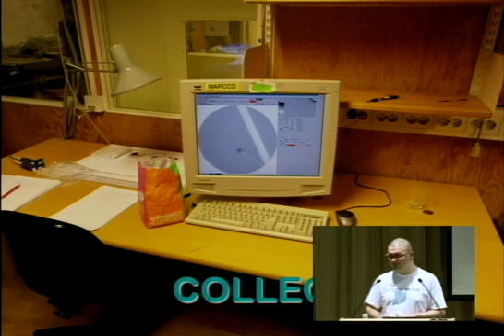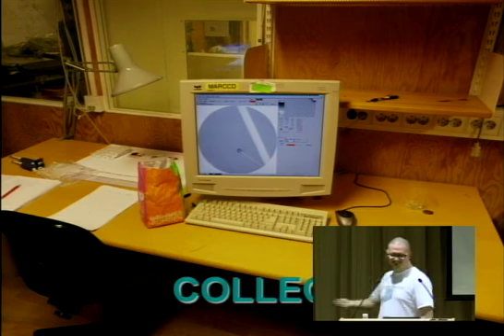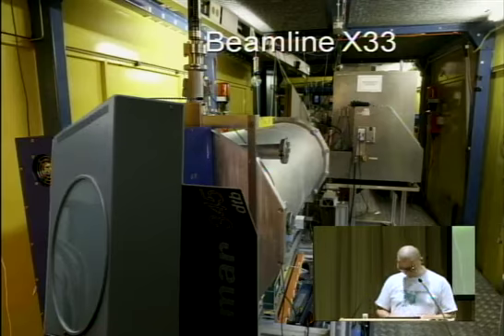Besides, when you have many samples and it is late at night, you start doing really stupid things. Like, you carefully load your sample, then you fight these damn bubbles that are in there, and finally you are satisfied with the result, and then you just take the syringe with your sample out and lose your sample, and you have to repeat everything again.